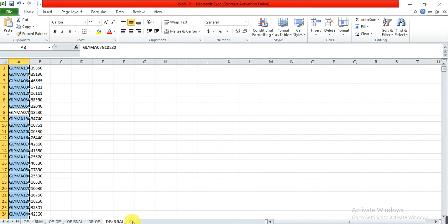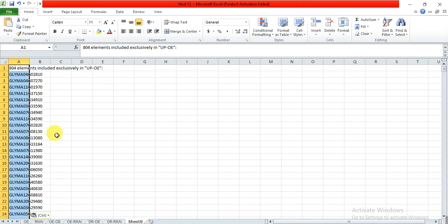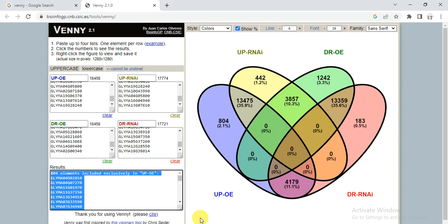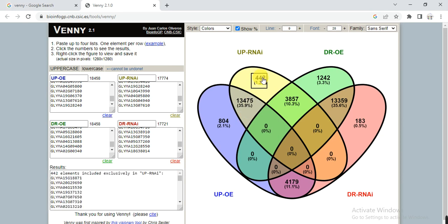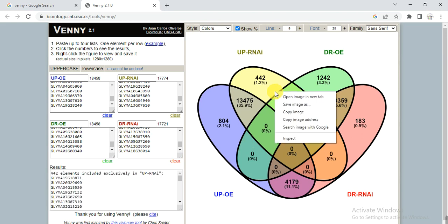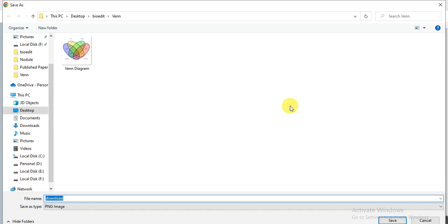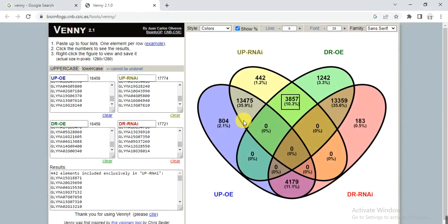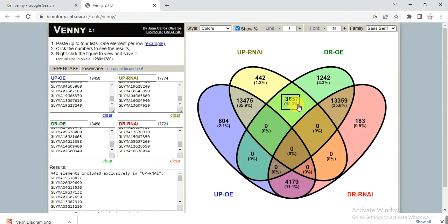You can click on any section to get the gene list, copy it, and paste it for your records. To save the diagram, right-click on it, select 'Save image as,' name it 'Venn diagram,' and save it to use in your paper, manuscript, or any publication. This diagram also shows the number of genes and their percentage.